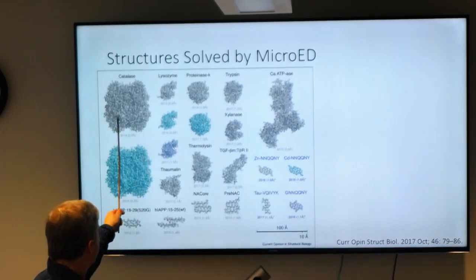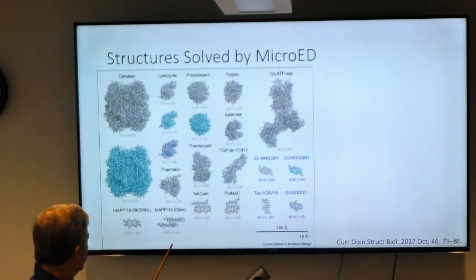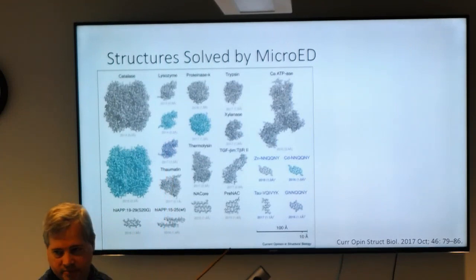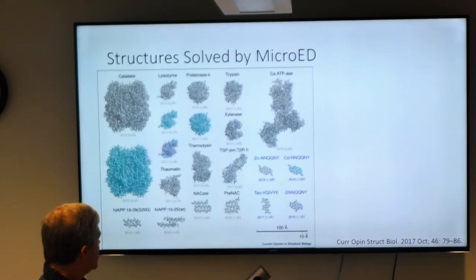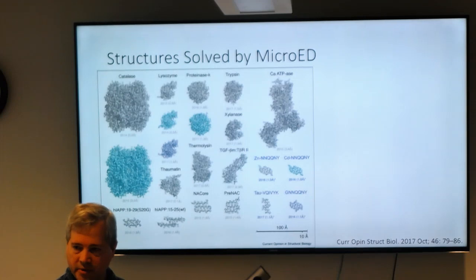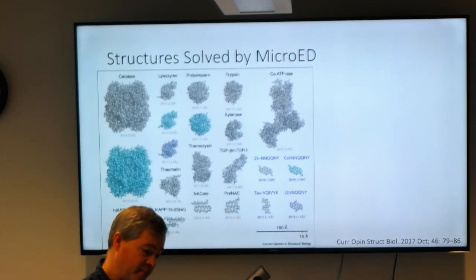In the course we did it with catalase and proteinase K, or lysozyme and proteinase K. I guess the reason they were first doing it on smaller proteins is because with anything bigger, why bother, just do single particle? Because then you're stuck with making a crystal again.